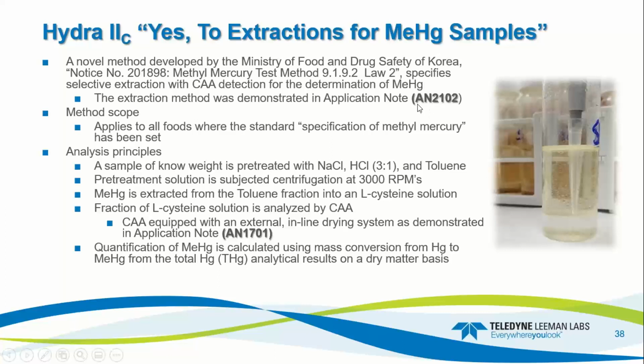The application note released for this is AN 2102, and I'm also using an external dryer, which is application note AN 1701.